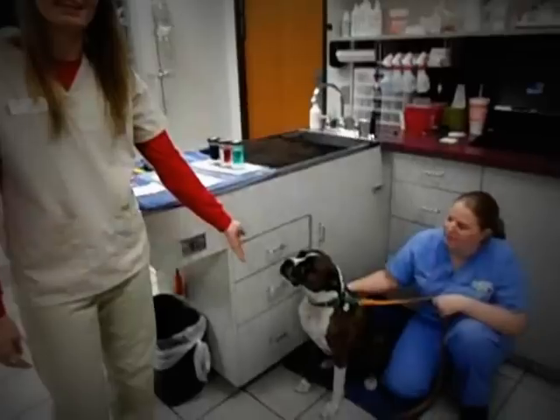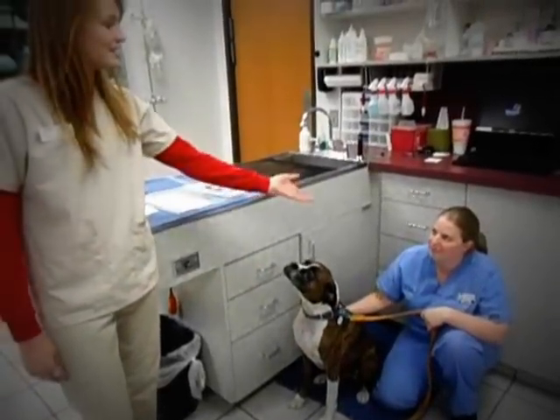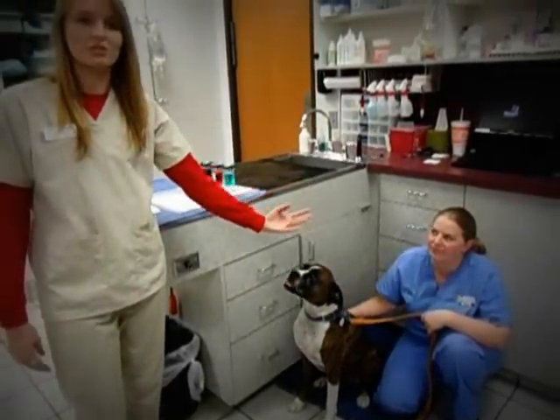Hi, my name is Haley Berkner and this is Elvis. He will be getting an ear cytology today. This is April. She will be restraining Elvis as I do this procedure.